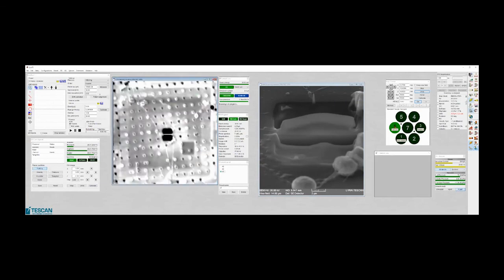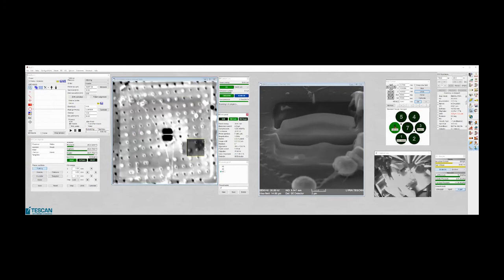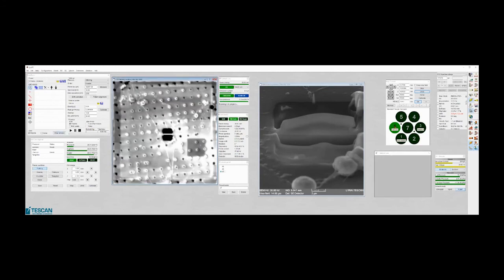It's somehow wrong. Okay, now it's better.